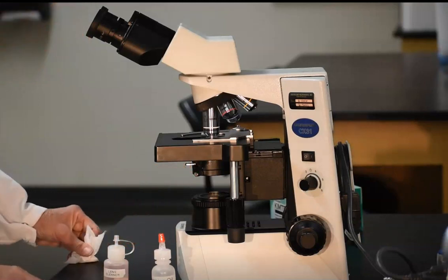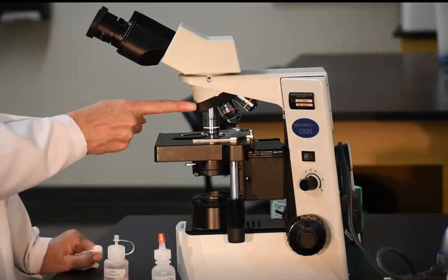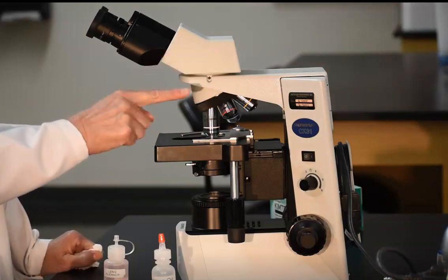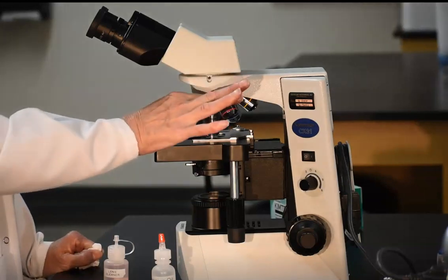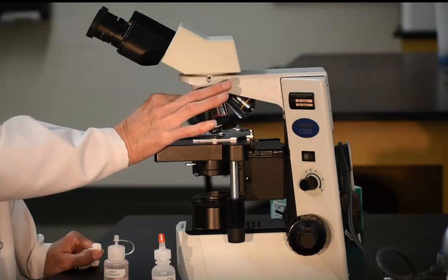An important point is, if the image is lost after you place oil on the slide, do not backtrack to the high-powered lens from the oil immersion lens. Oil will get on the lens and it will no longer focus until it has been thoroughly cleaned.